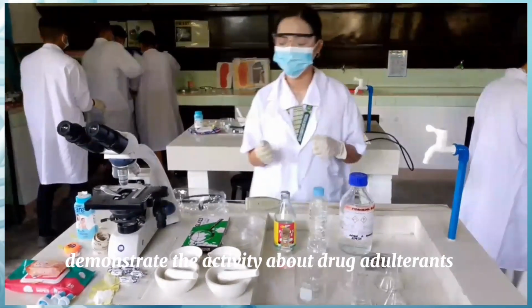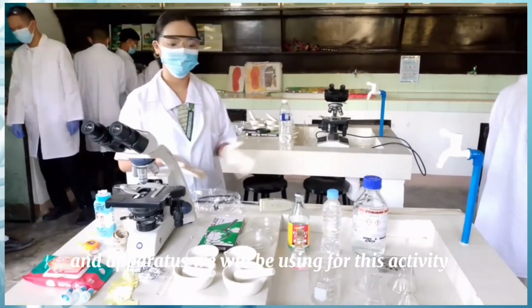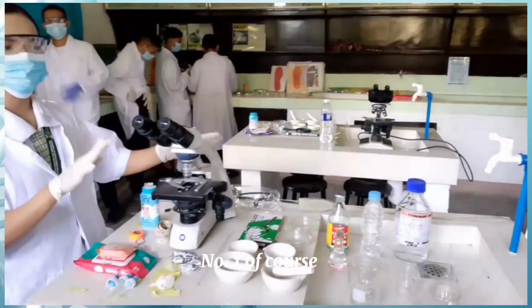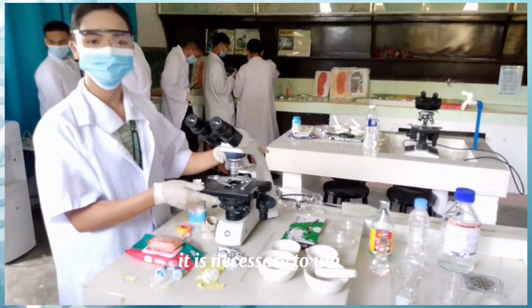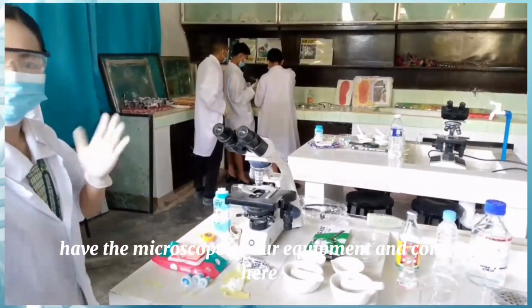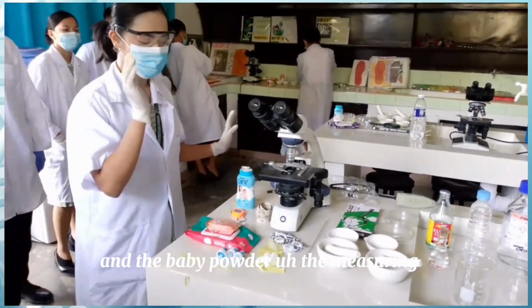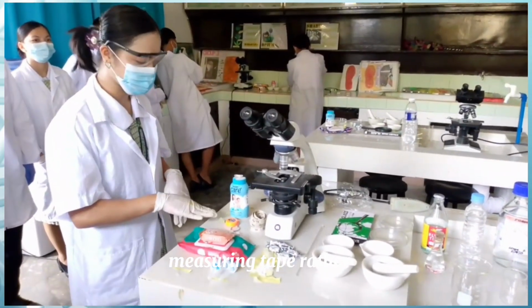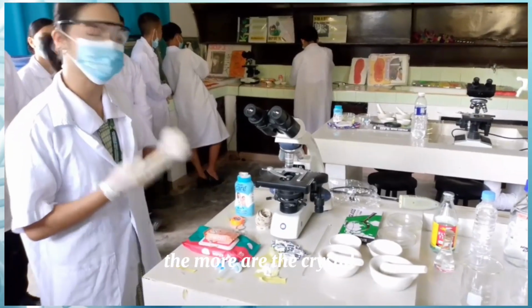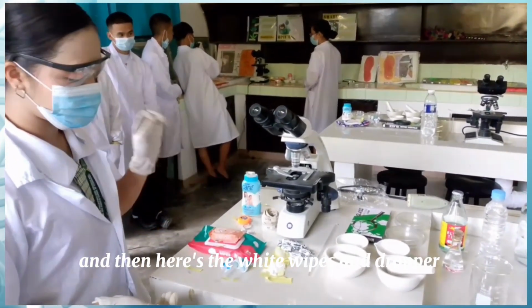The activity about drug adulterants, and I will be introducing you to the equipment and apparatus we will be using for this activity. Number one, of course, it is necessary to have the microscope as our equipment, and here the baby powder, the measuring tape rather. We have two right here, and then the paracetamol or the crystal, and then here are the wipes and dropper.